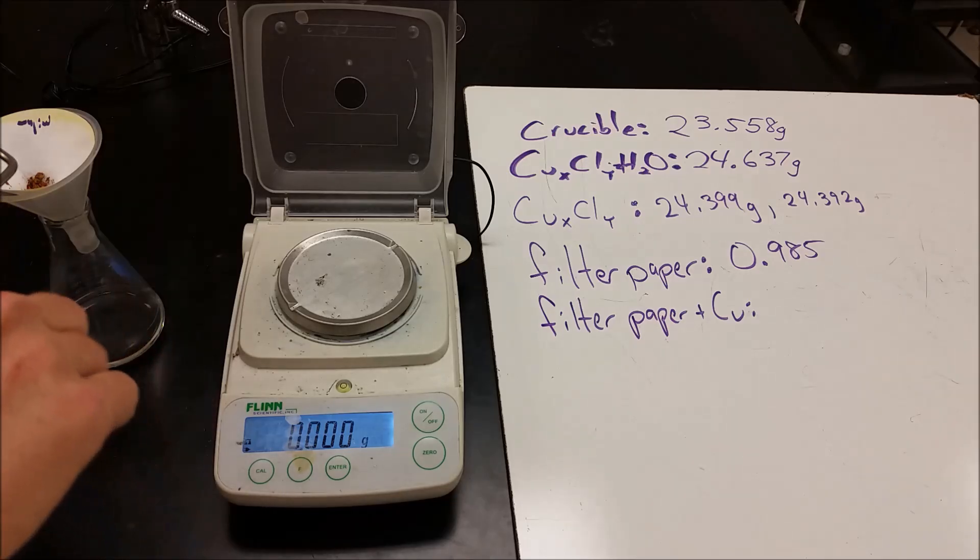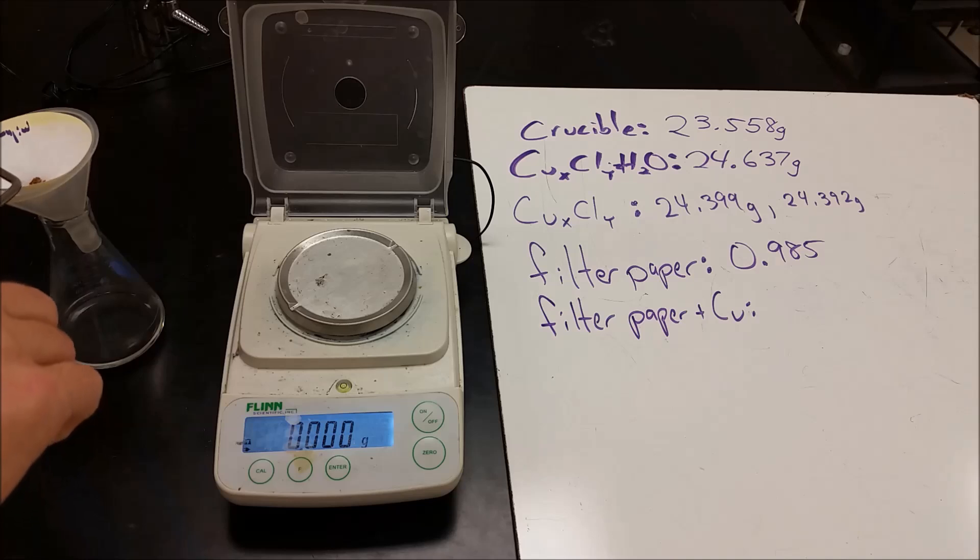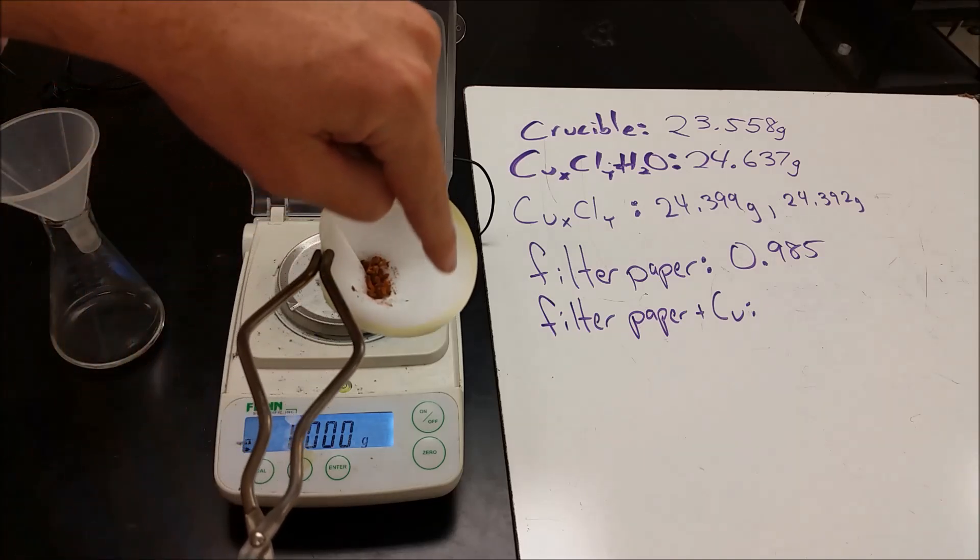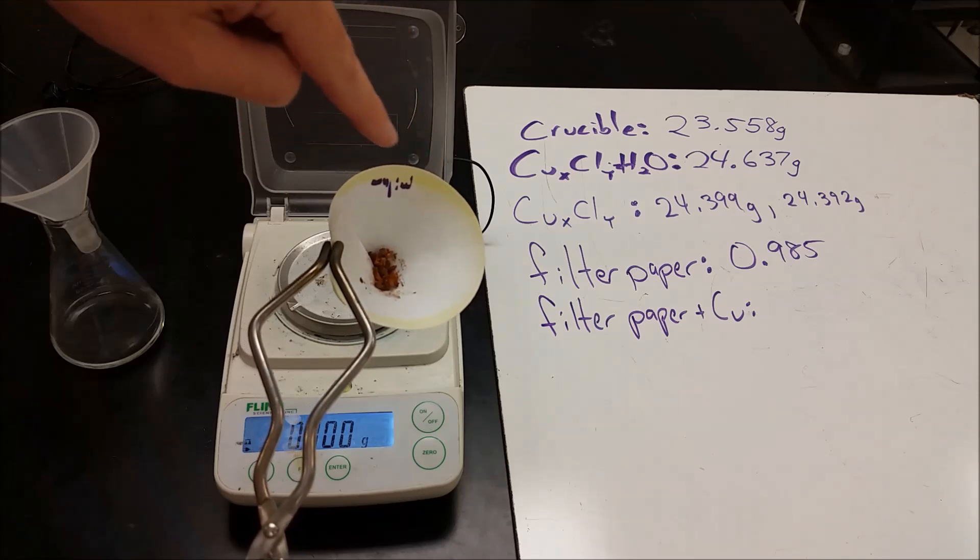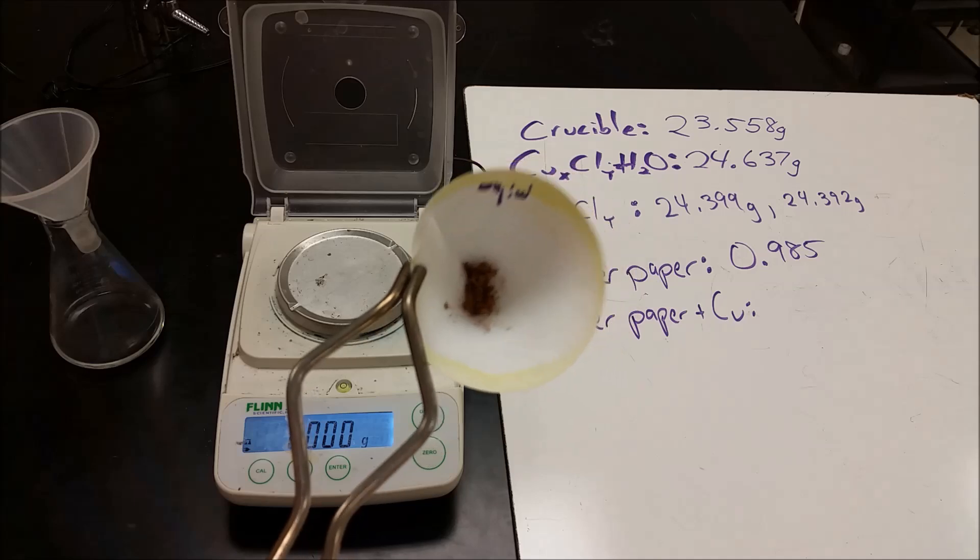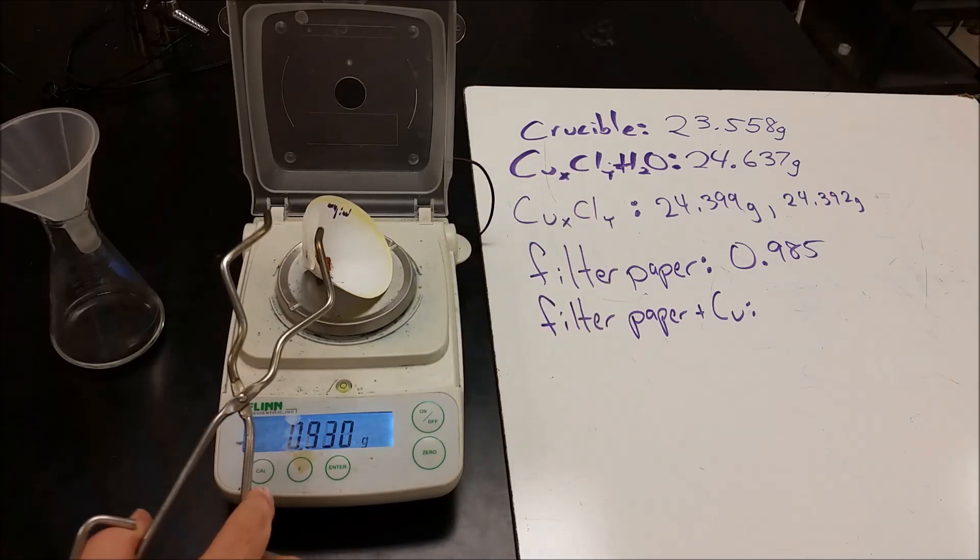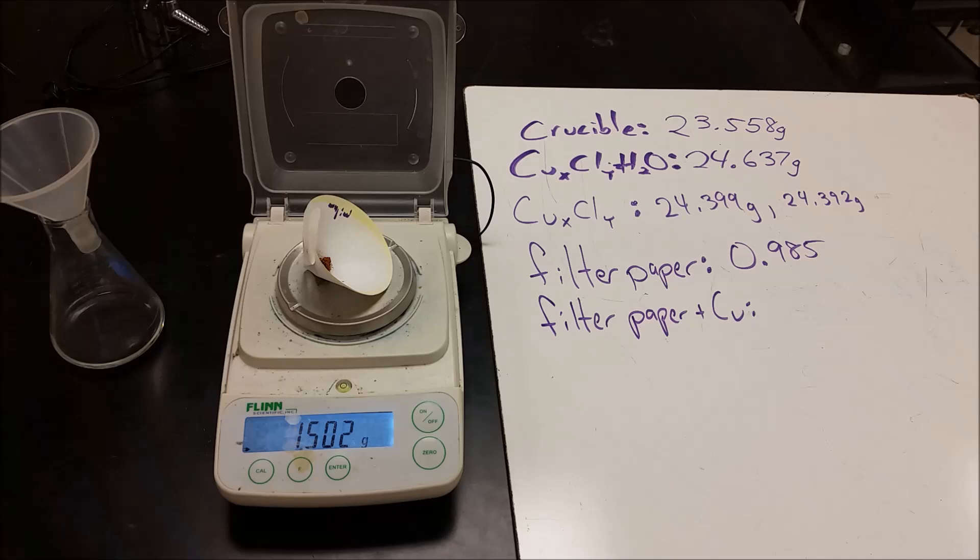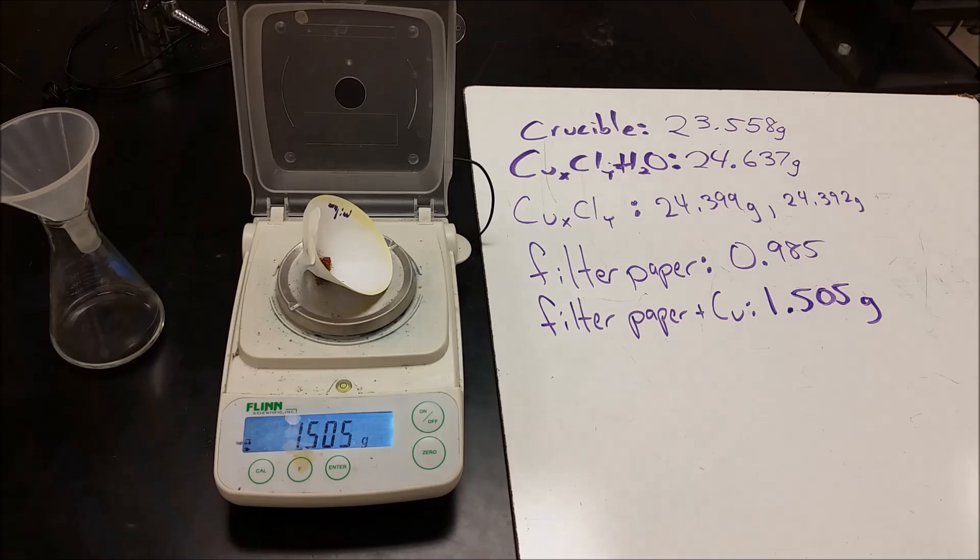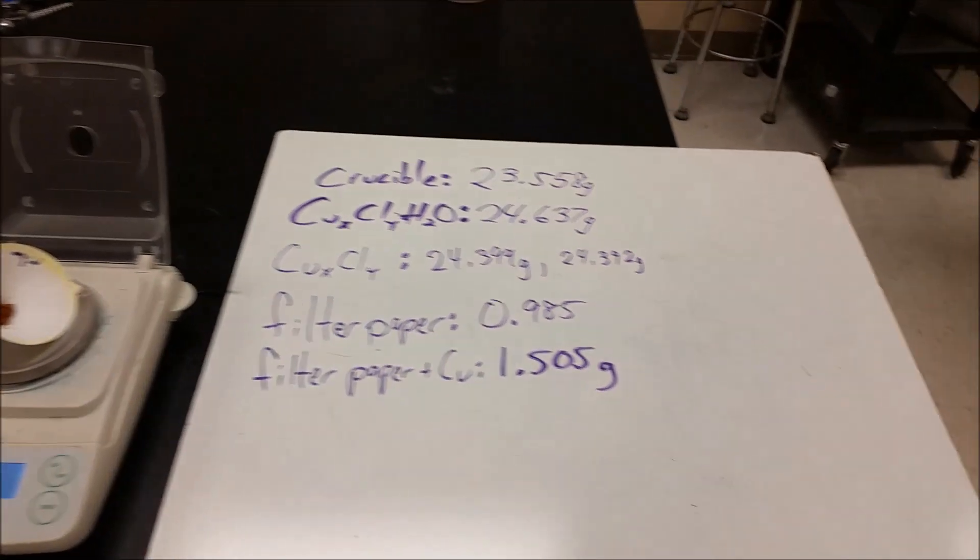So on our last step here, we're just going to get the mass of the copper that's left in our filter paper. And you can see we have a little bit of residue here, which means that we didn't properly wash completely the filter paper, but otherwise we have our pure copper there. And we're going to set that on here. So the difference between that and our filter paper, we can then go ahead and figure out how much copper there is.